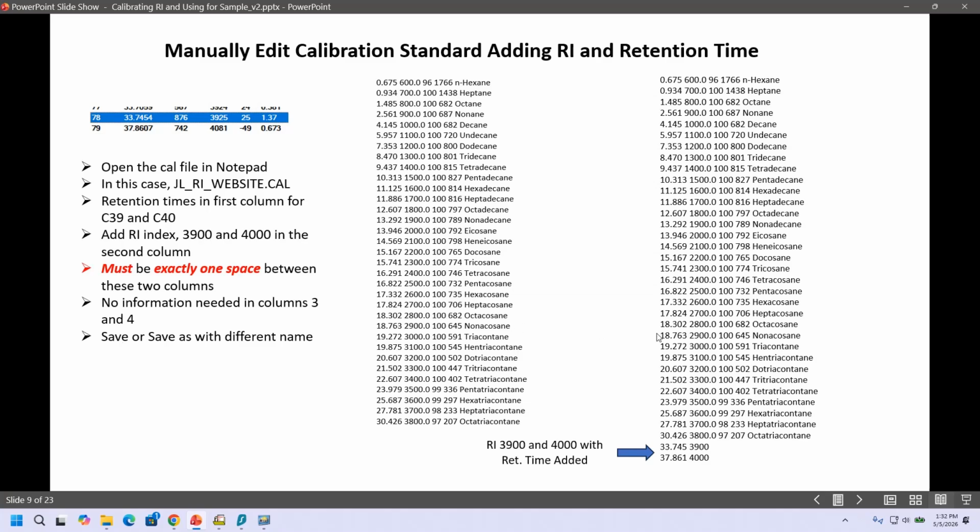And you can see if you needed to calibrate or look for something that had a shorter retention time, you wouldn't necessarily need to add these. You just need to bracket the compound of interest that you want to do by at least 2 of the calibrations. So if you needed something that came between 19 and 20, you don't need the 39 and 40 to do your work.